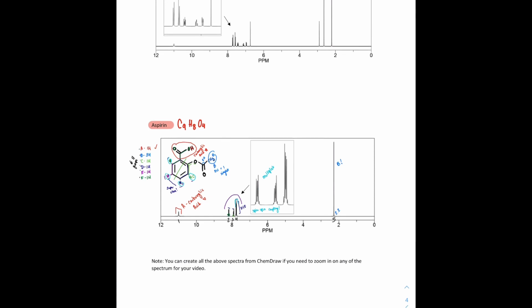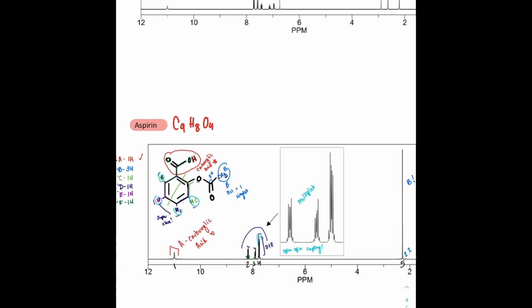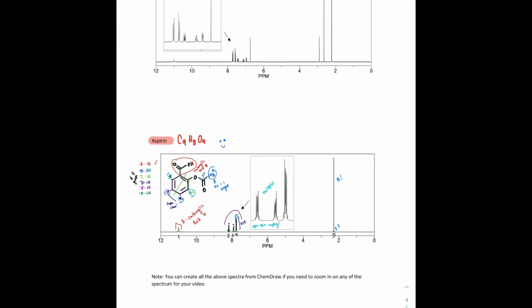So overall, I'm feeling pretty good about this analysis, and I think that we have thoroughly proved that all of these peaks correspond with these different groups. So I'm going to add a little smiley face to this one too. And then I think that we should be good to go.